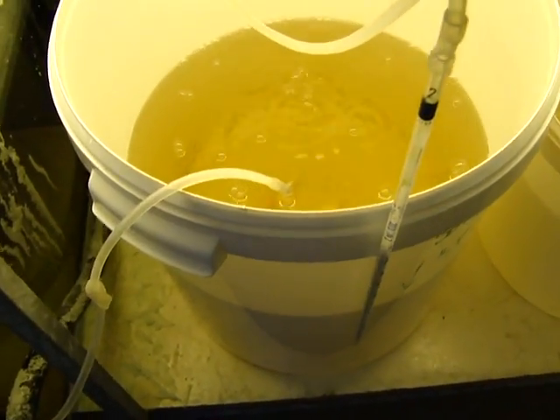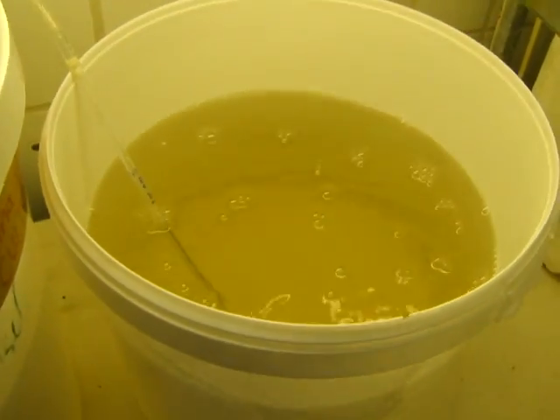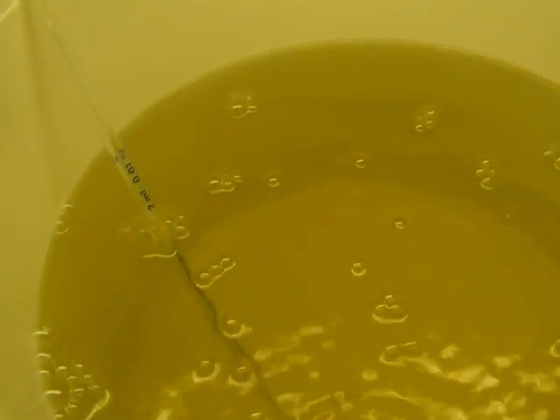Here we have the Moina Salina and other Copepods, but most of them are Moina. Here is the Moina — as you can see, it's a saltwater or seawater cladoceran, useful for aquaculture.